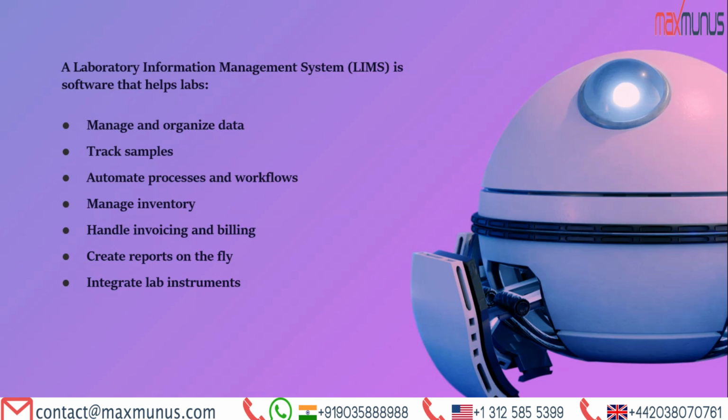A laboratory information management system is software that helps labs manage and organize data, track samples, automate processes and workflows, manage inventory, handle invoicing and billing, create reports on the fly, and integrate lab instruments.